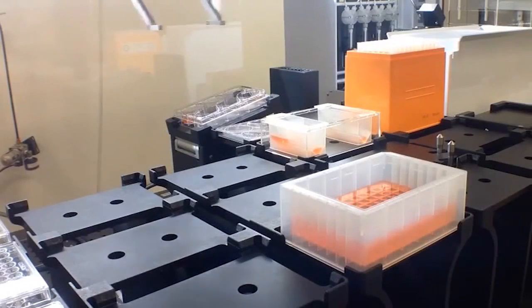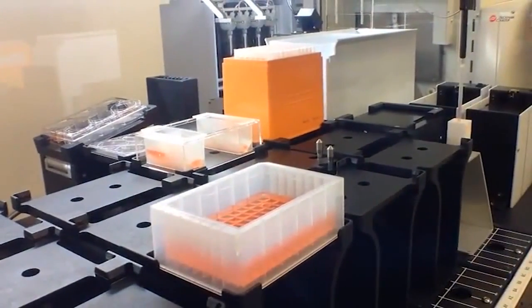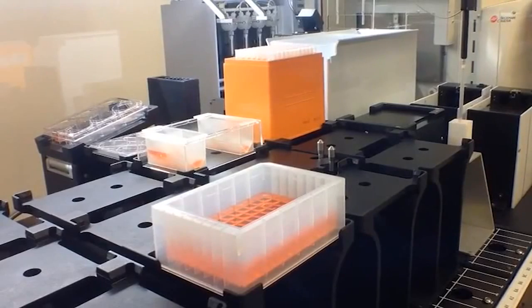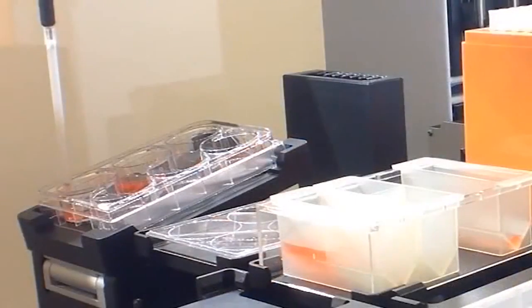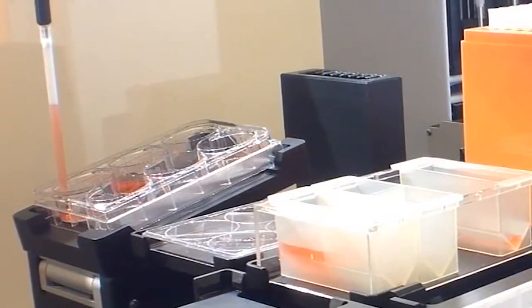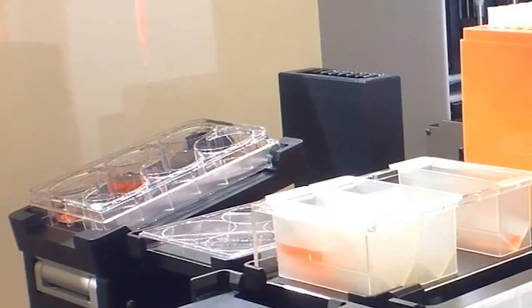A portion of these resuspended cells were then added to the sample cup for the integrated ViCell cell viability analyzer, and the ViCell returned a viable cells per mil number, which the BioMek was then automatically able to use to calculate what volume of cells needed to be transferred to reach a certain number of cells. If the volume was over 1 mil, the capacity of the tip, the split volume step could be used to automatically transfer the larger volume.